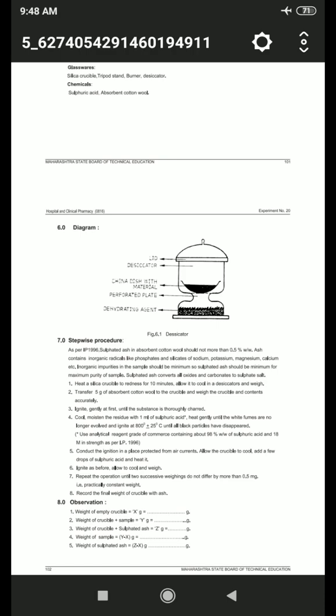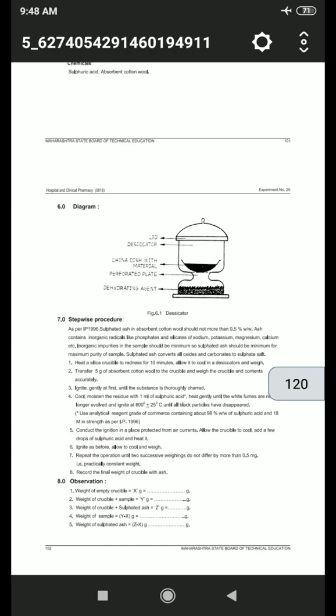Okay, when the indicator in the desiccant changes color, it is time to recycle it. Desiccators are used to store the weighing bottles that have dried chemicals in them, and they maintain a constant low humidity. It takes overnight for chemicals or glassware to equilibrate to this state of standard dryness. When the indicator in the desiccant changes color, it is time to recycle it.